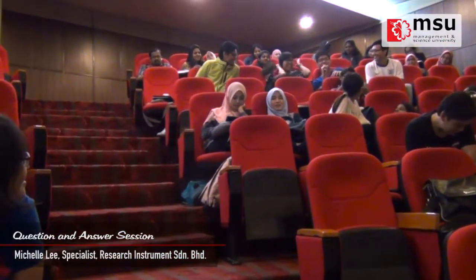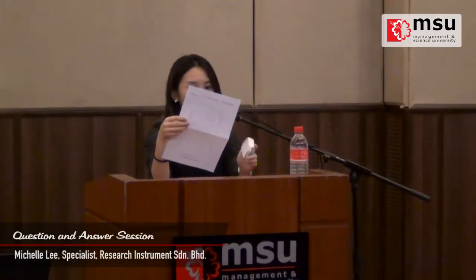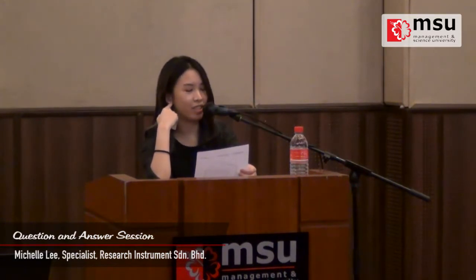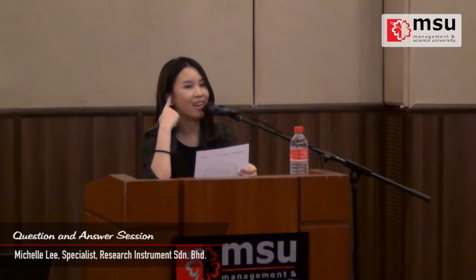Right? Okay, so the next question: what is the software name for CAMAG HPTLC? The software name. VisionCATS. Yes. Okay, maybe I'll just ask the last question. What is the extra information that you will only get in thin-layer chromatography that is absent in other chromatography techniques? What is the extra information that you can get? We can get the visual images. Yes.